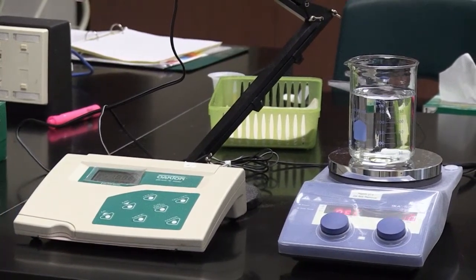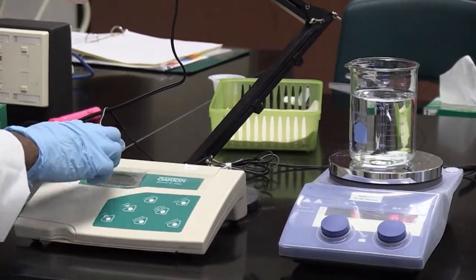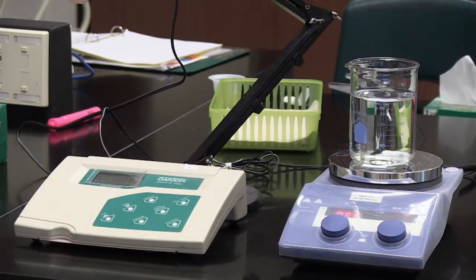The measuring mode is the mode that you use to measure the pH of solutions. So I don't have to make any other adjustments. In your lab, most likely, your pH meters will also be in the measuring mode.